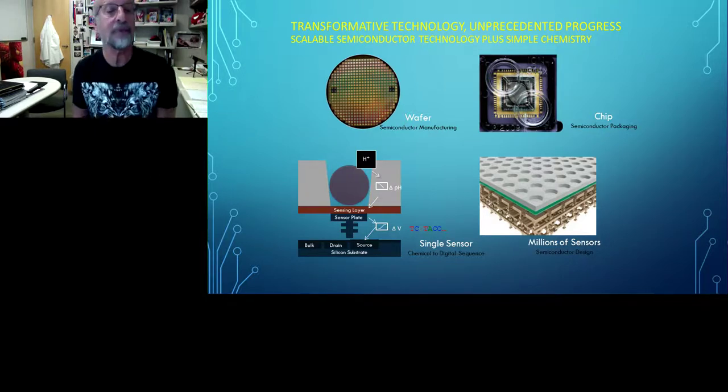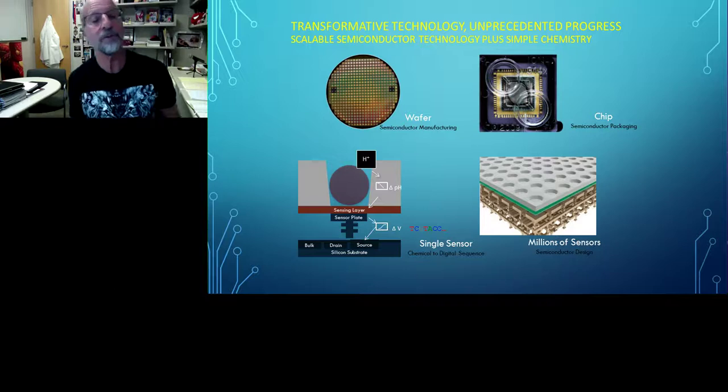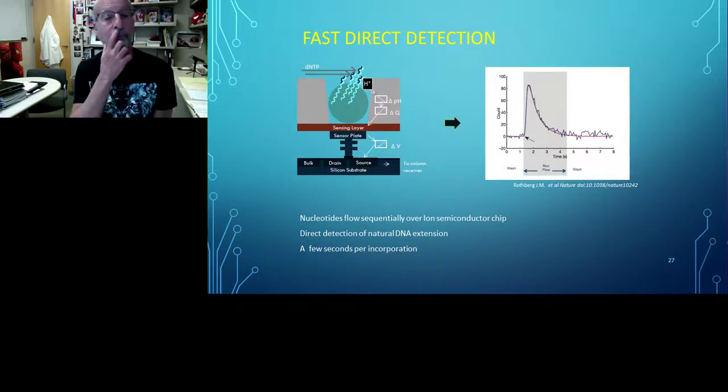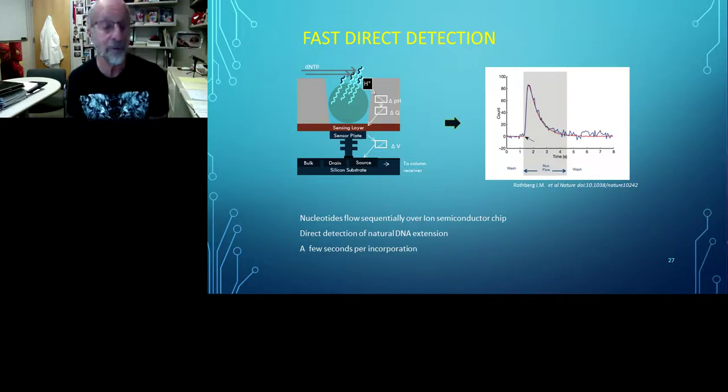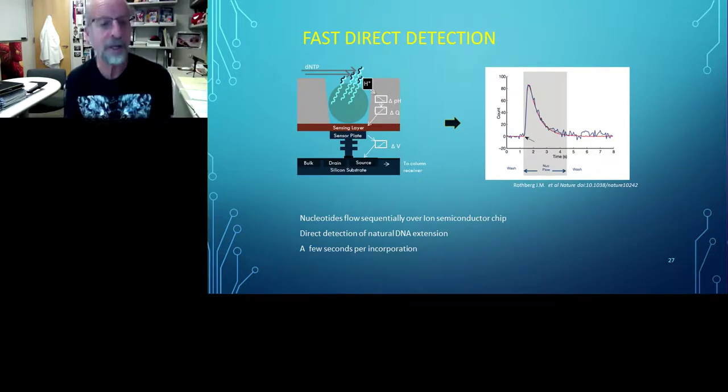So basically, if you amplify DNA molecules on beads, very similar to the beads from the 454, but smaller, you can do the exact same thing that you did with 454 sequencing, but instead of using enzymes to see the emission of light, you're going to look for the change in pH. So then by putting this all together, you flow A, C, G, and T unblocked nucleotides across it, and if one is incorporated, and this is shown on the right, you're going to see a change in pH in that well. That will be an indication that that base has been incorporated.